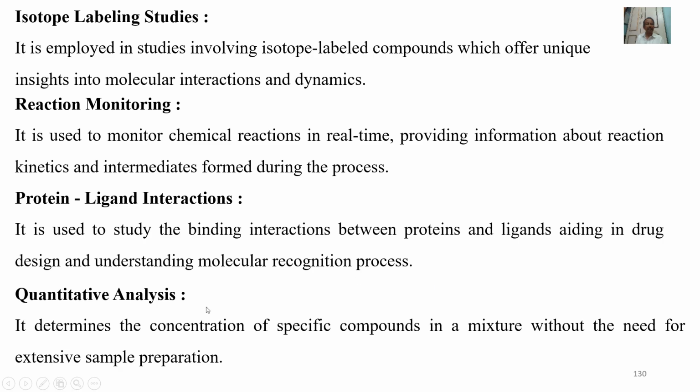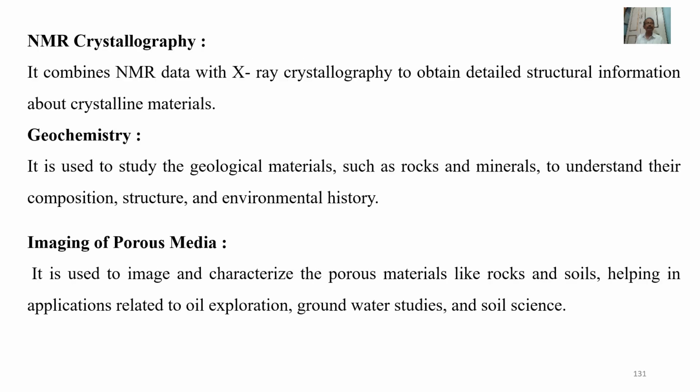Quantitative analysis. It determines the concentration of specific compounds in a mixture without the need for extensive sample preparation. NMR crystallography. It combines NMR data with X-ray crystallography to obtain detailed structural information about crystalline materials.